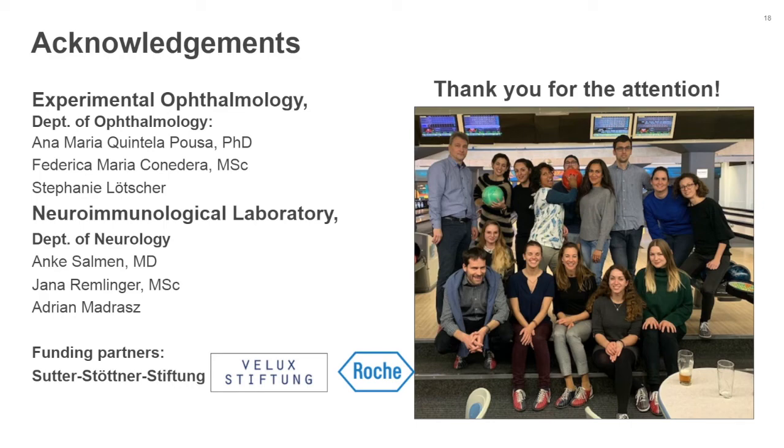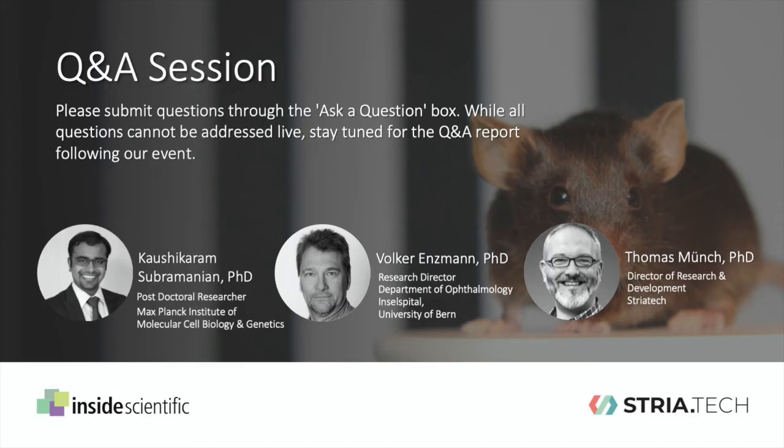Thank you very much. Now I'm going to welcome everyone back to the audio line, and we'll jump straight into our Q&A session. So our first question of the day is for you, Volker. Is the optomotoric reaction comparable to the optokinetic reflex?